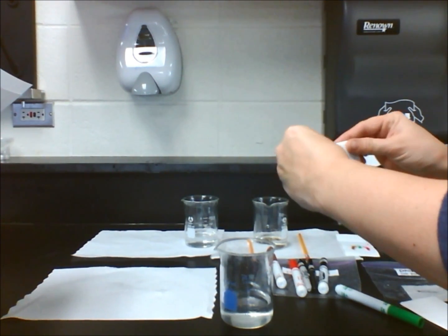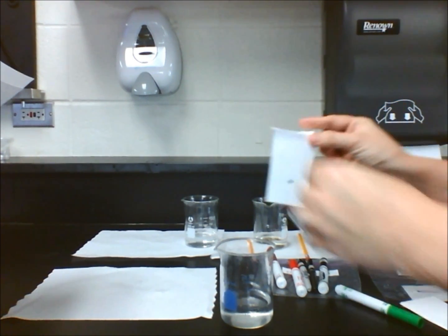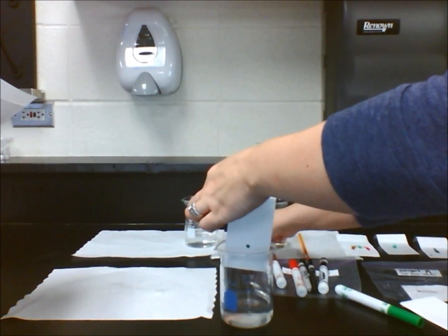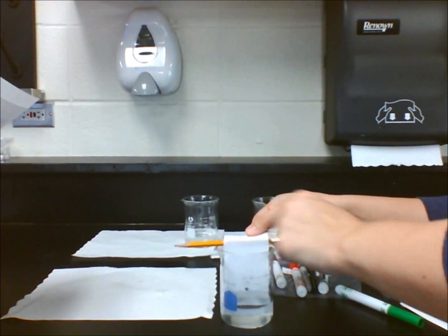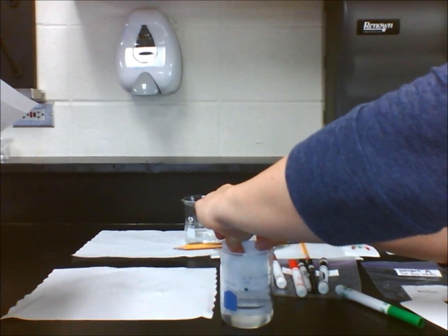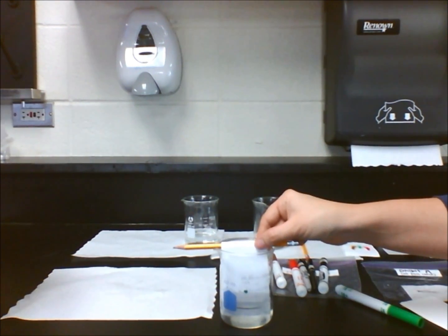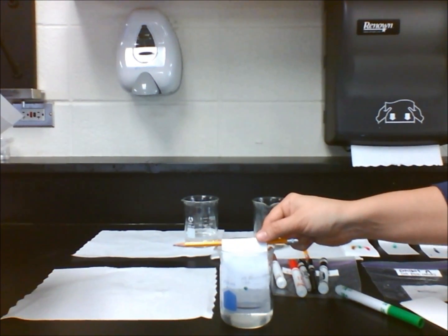Fold over the paper about 3 cm from the top. Rest a pencil across the top of the beaker containing the water. Hang the paper on the pencil so that it touches the water. Make sure the spot of ink is above the surface of the water.